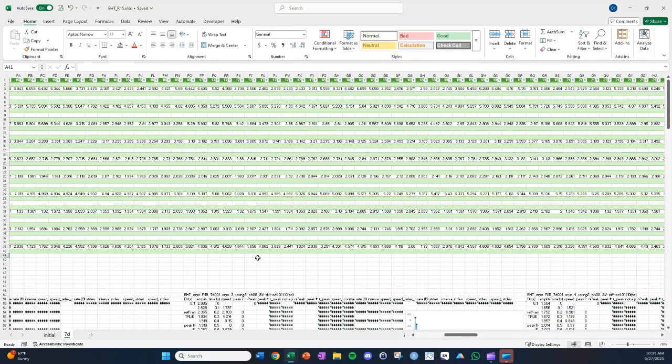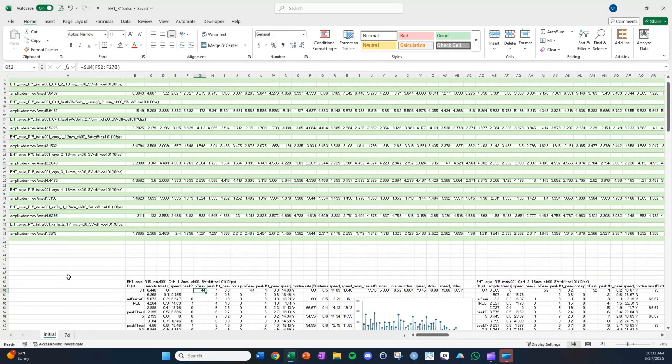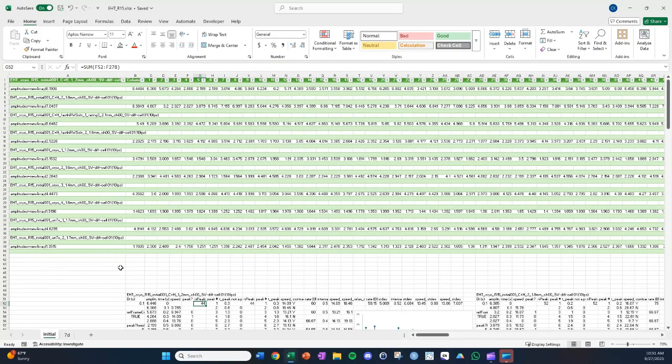Yeah, and you might notice that this Excel template is set up to handle 12 videos. You might have more videos than this. I think if you're using a computer with 16 gigabytes of RAM to run MYOCYTER, you can analyze up to 15 or 16 videos at a time. In that case, you might just need to remake the template. But for all the runs I've been doing, this has been sufficient. So that's just why I made the template like this.